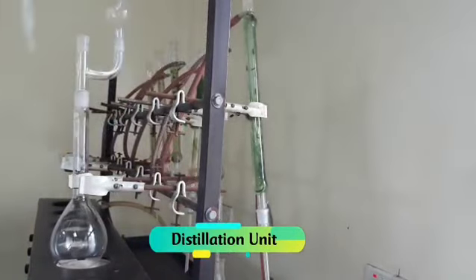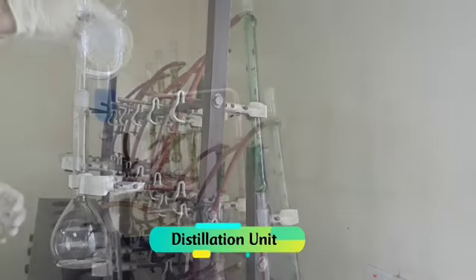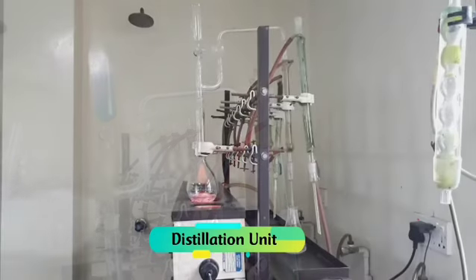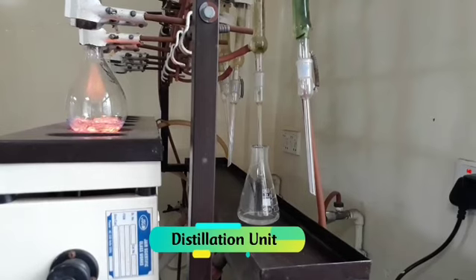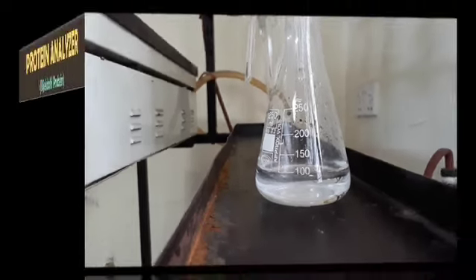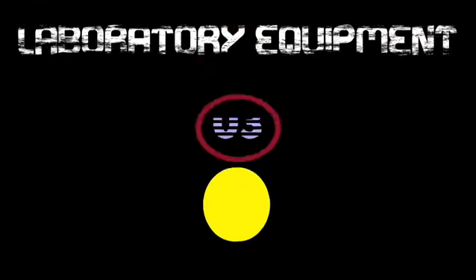Advantages: it provides highly accurate nutritional analysis, essential for food labeling and for researchers. In the food industry it is used for protein content analysis in milk, meat, cereals and also in animal feed, for regulation and quality control. In the distillation unit you can see that the liquid from the digestion unit is secreted into it. Applications are protein analysis by the Kjeldahl method, digestion of the sample, and distillation of the solution.